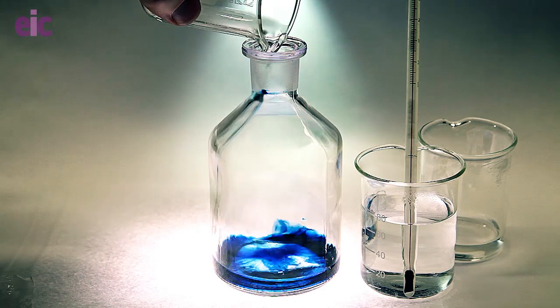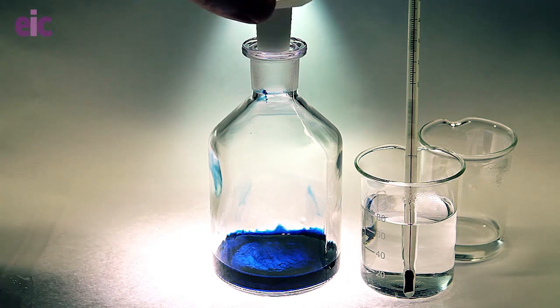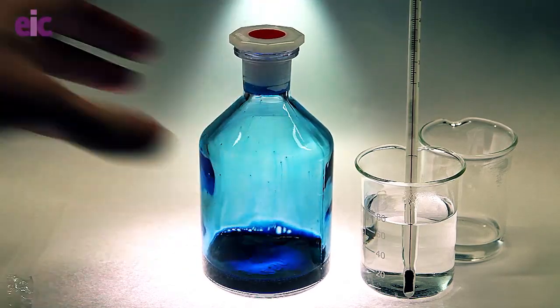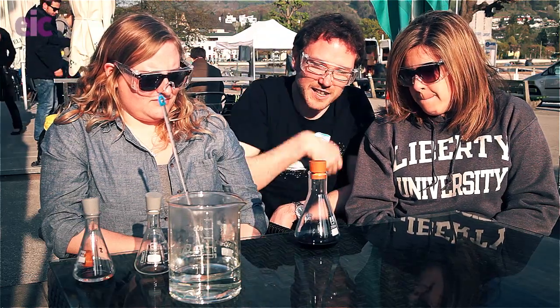It's indigo dye, slightly adapted to help it adhere to more like wool and natural non-cellulose based fibers. And it gives us this really nice blue color, and we're going to be having a look at some of the colors that we can get from this dye.